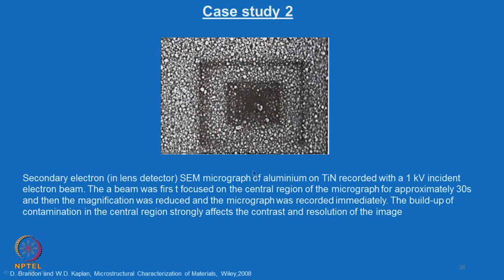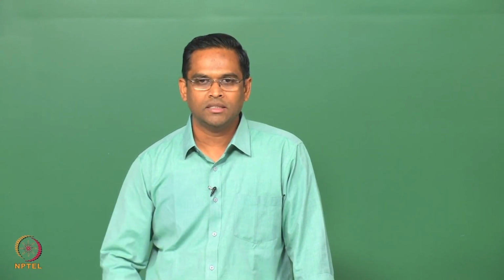So, if you expose a beam-sensitive specimen like this to the electron beam for more time, the buildup of contamination is inevitable, and that is why it is very important that you do the recording very fast. You have to take that precaution. And then why this contamination is forming, and the reason for the sample to be clean, is something you have to clearly keep in mind. In order to do that, let me write a few important points.